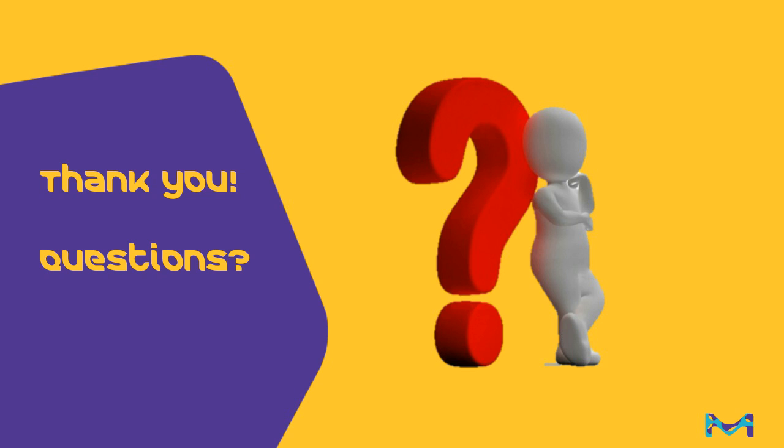All right, Felice, I have another question for Sasha, but if he's not here with us, I'll throw this one at you. Can the software be used to create custom libraries from derivatized metabolites? Oh, another good question. That's a feature that we're going to build soon in subsequent software versions, and it's certainly in our pipeline. What we really would like to do is have the software used for any compounds, for any standards that you would have. So yes, that's in the pipeline.